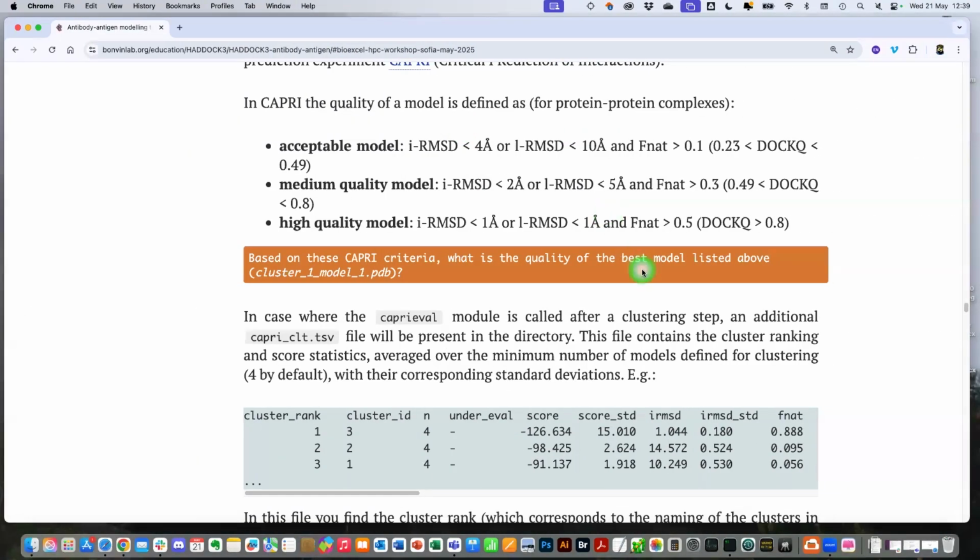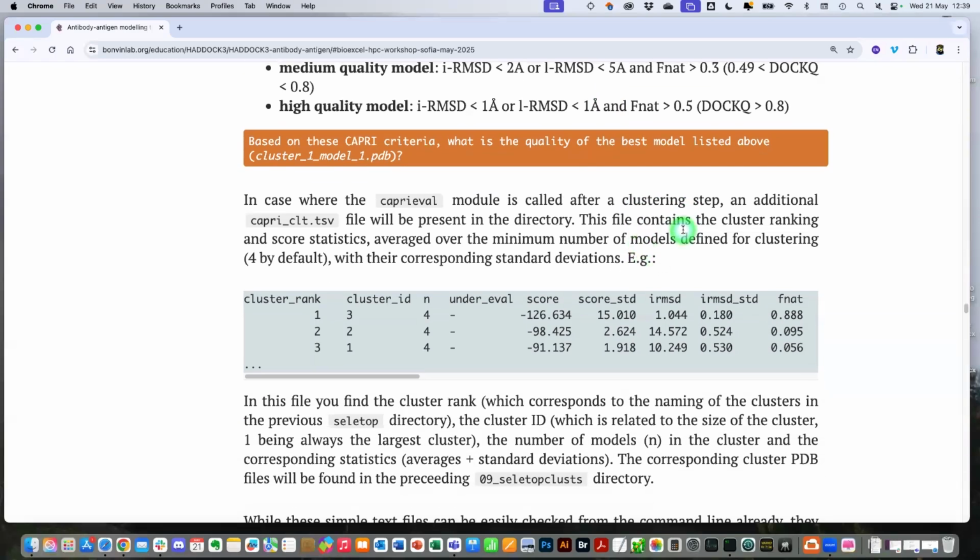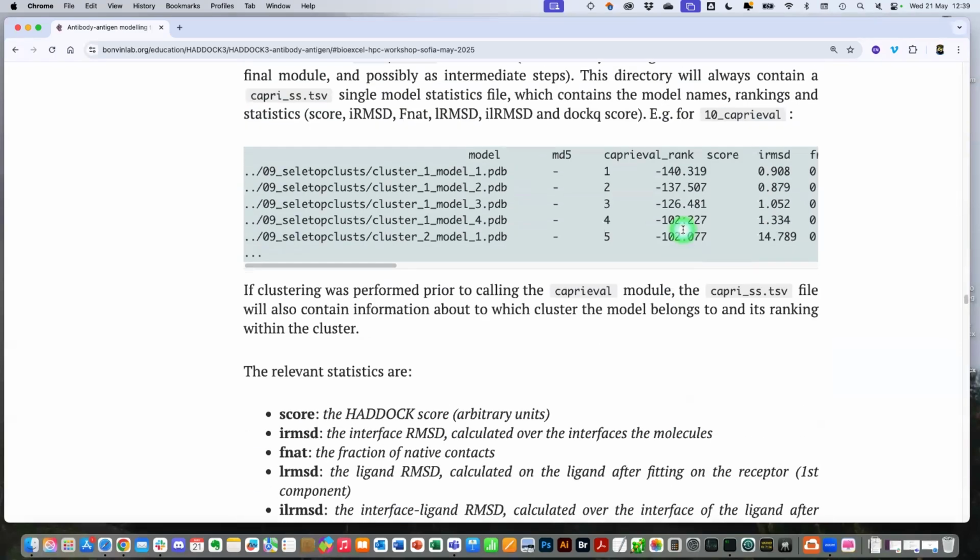And what you see here is slightly different. This is what I got by running on my laptop. So you have to realize that you will never get exactly the same results if you don't run exactly on the same hardware. CPUs are different. We are adding a lot of real numbers, so it's floating point operations.